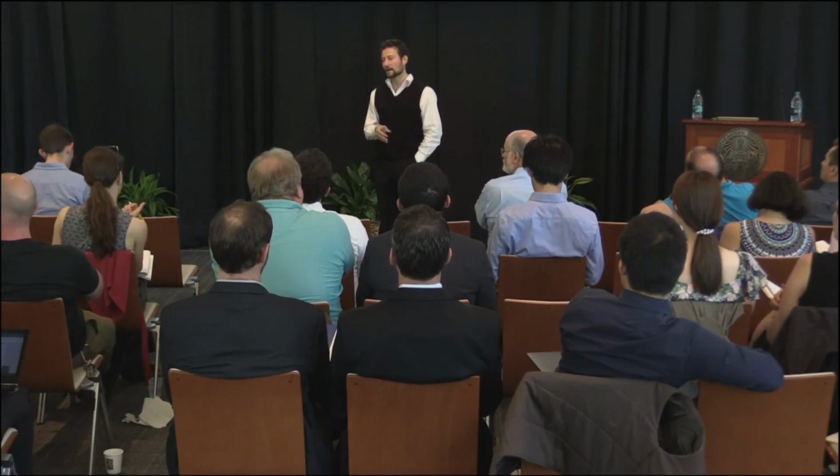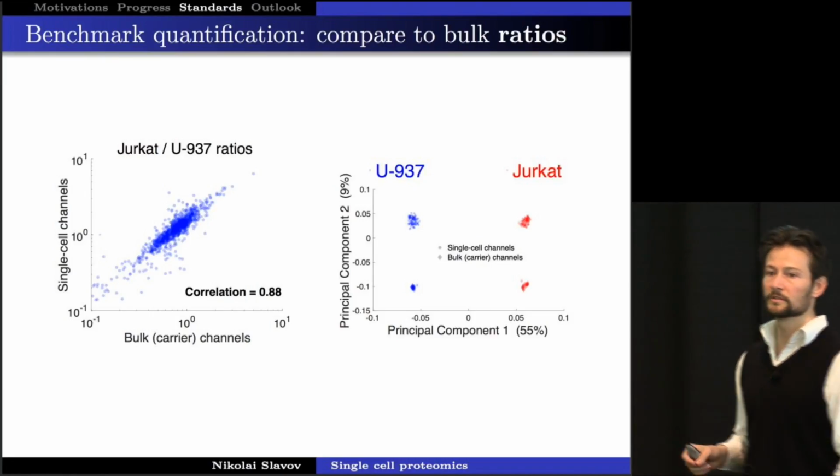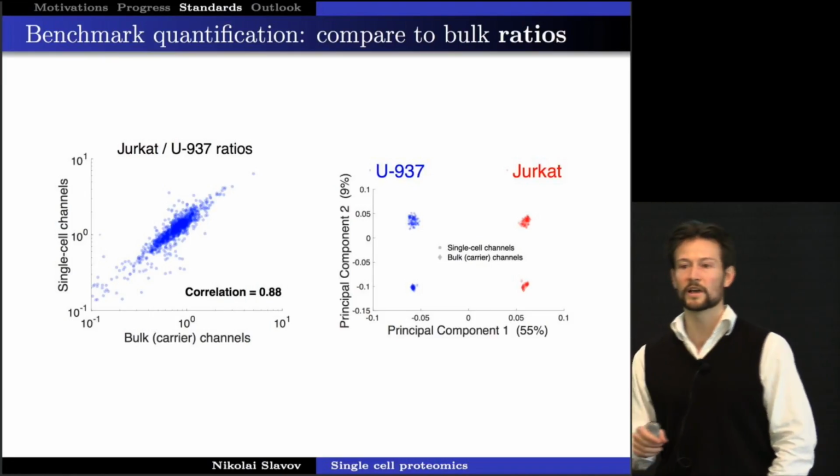to the results from single cells is something that I think is relatively easy and should be more widely used, rather than these 5 orders of magnitude log-log plots that don't tell us much, other than that the material looked like a human cell.